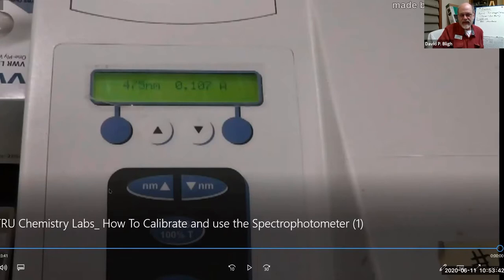The ABS is an abbreviation for absorbance. So when you set the machine to 0, or you blank the machine with your distilled water, you're telling the machine that this container, with whatever it contains, in this case water, is your 0 point. No absorbance. So even if it does have absorbance, you're telling the machine to set it at 0 there.